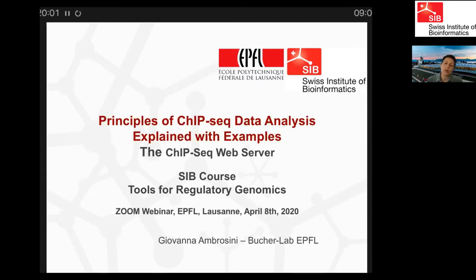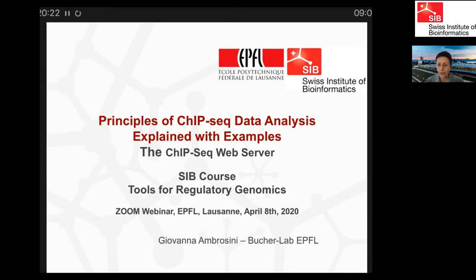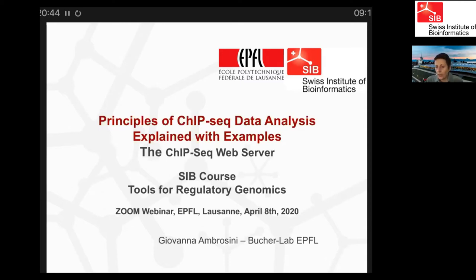I will explain ChIP-seq analysis via a step-by-step tutorial through our two main web platforms: the ChIP-seq server for ChIP-seq data analysis, and the Signal Search Analysis or SSA platform for motif analysis. Our goal is to get you acquainted with our tools. We think they are quite easy to use, very useful for data exploration, and you can run even complex pipelines rapidly and in an interactive manner.